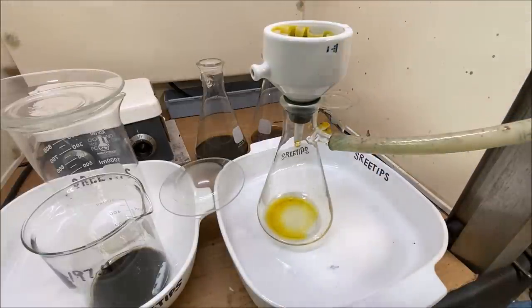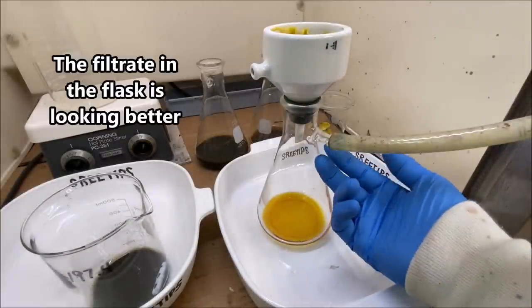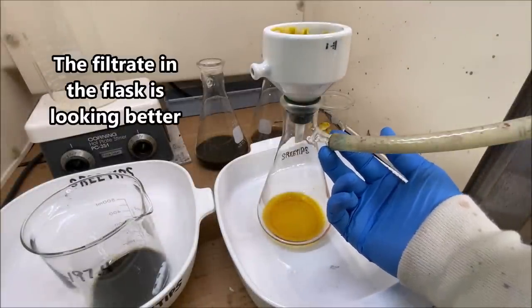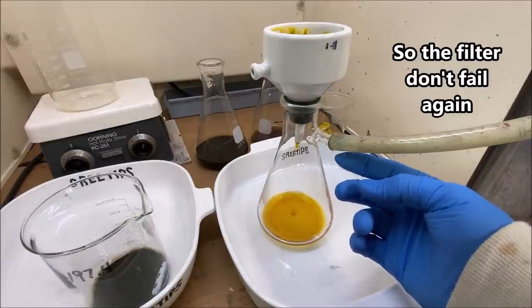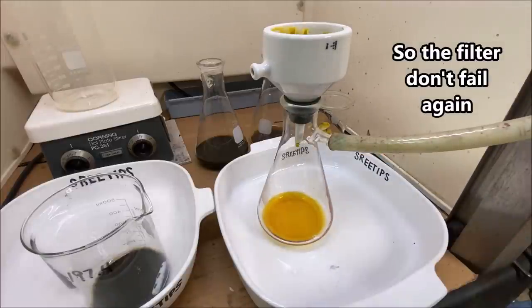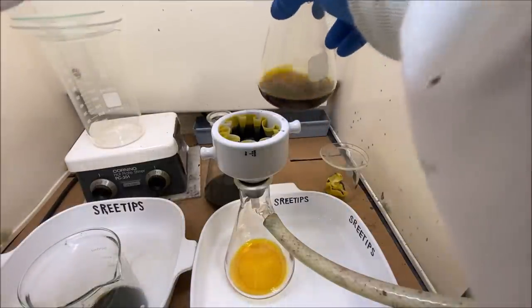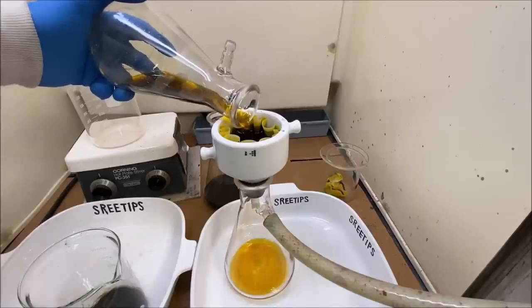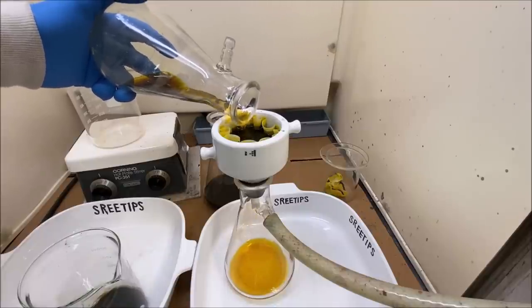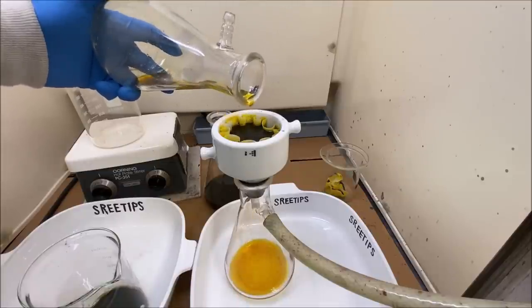Not pulling a bunch of black material through the filter. Seems to be working out okay. I've got this connection real loose right here, so it's drawing air to keep the vacuum that I'm pulling low. I just realized I had a vent valve over there that I could open to relieve some of the vacuum. So I just opened that. Now that this filter's loaded up, we should be able to filter the black solids out of this liquid.